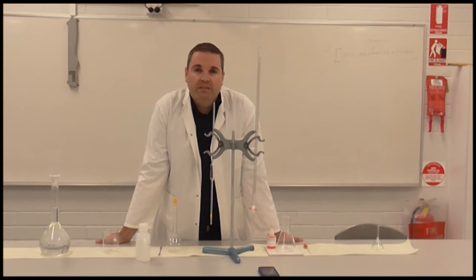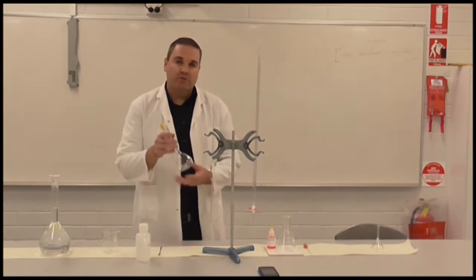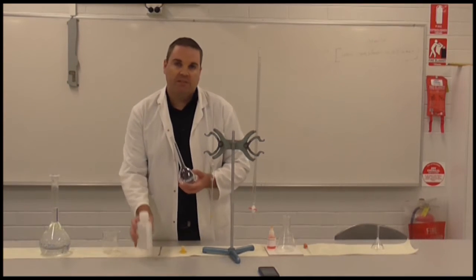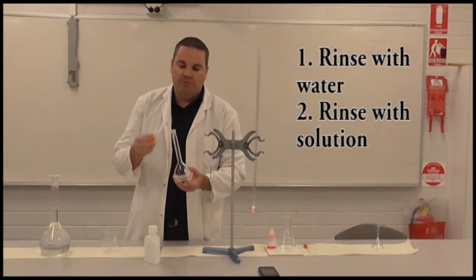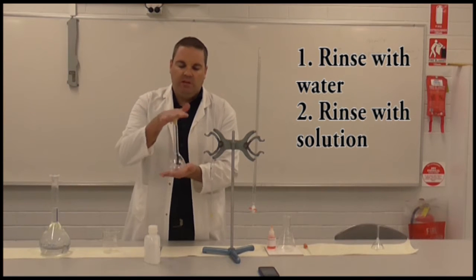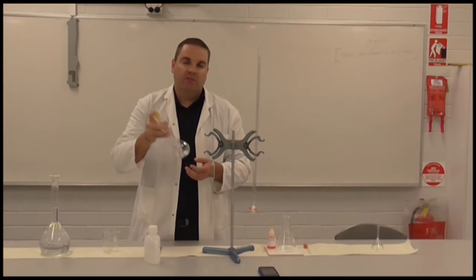What I'm going to go through firstly is the correct way to make a standard solution. A standard solution is a solution of known concentration and purity. We start off with a volumetric flask — this is a 200ml volumetric flask. The first thing you always do when you make up a standard solution is rinse it with some distilled water. That helps to get rid of any impurities from previous experiments. Squirt in a small amount, stopper it, swirl and shake using two hands, invert it, and make sure you coat all the inside surfaces of the glass.